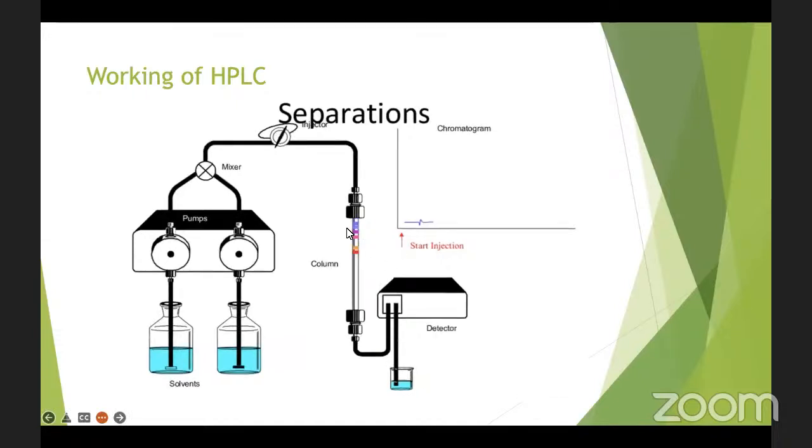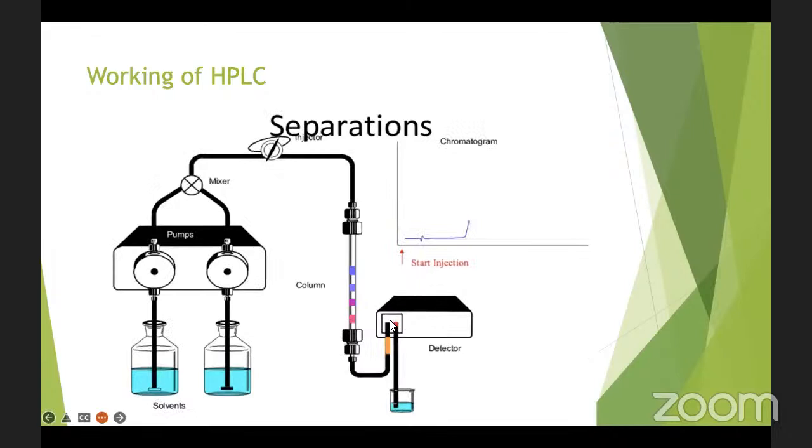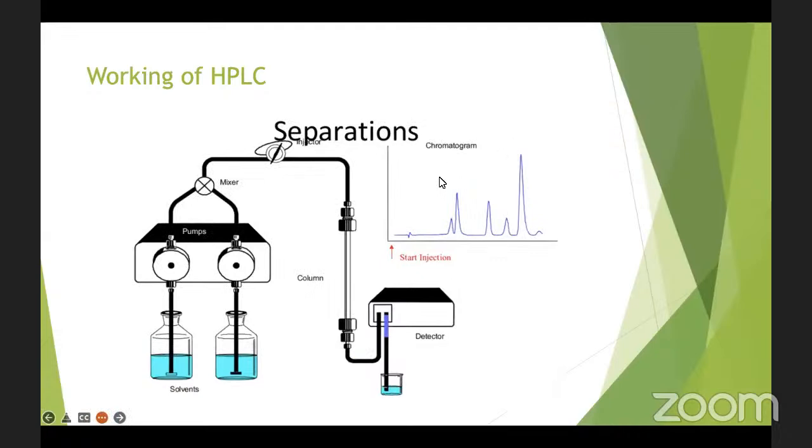Further, this separation is going on and we can clearly see the bands. These bands will be further separated, and now the bands are leaving the column one by one. The first component has left the column and gone into the detector, so we see the first peak. The second component, see the second peak. If we calculate the area under this peak, we will get the amount or quantity of component A that was present in the mixture. By calculating the area of this peak, we'll know the quantity of the second component in the mixture, and so on. Now the final component has left, and you can see the final peak.